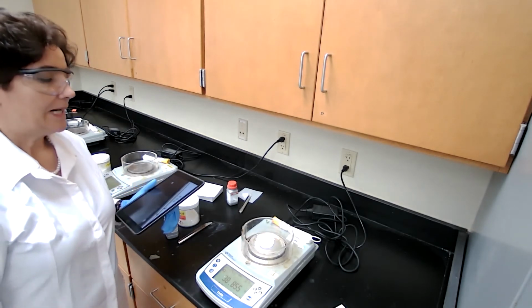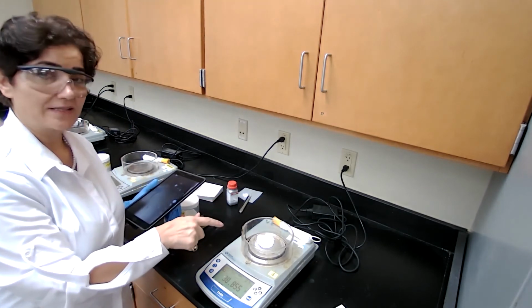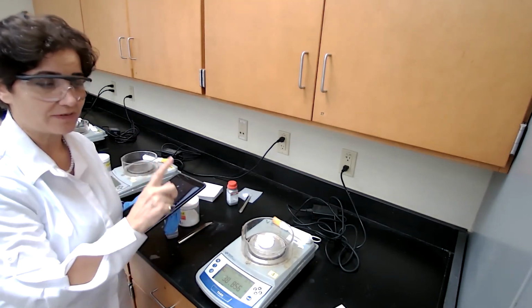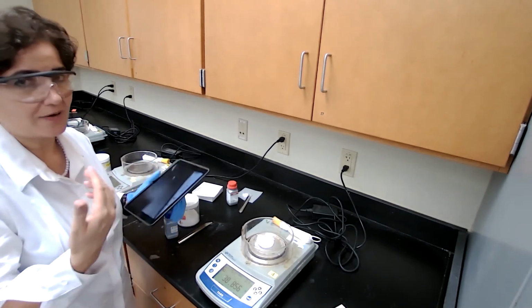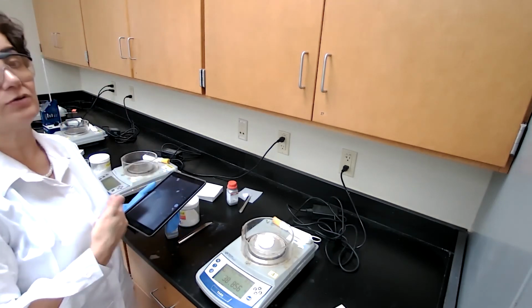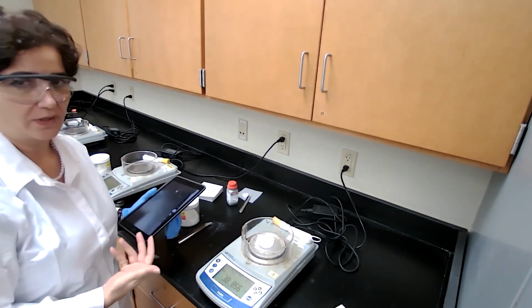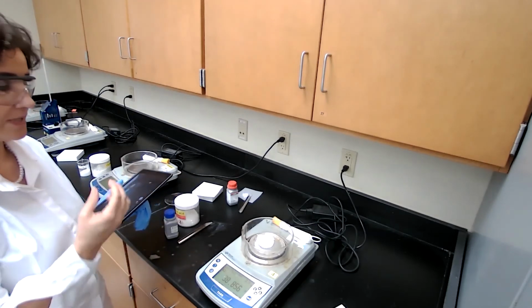And I'm going to measure the melting point of the benzoic acid and post the pictures of initial melting and final melting as well. You already know how to prepare the sample. You already know how to measure the melting point. You don't have to watch that part of the video. So the video would be paused during the melting. You would see the numbers.